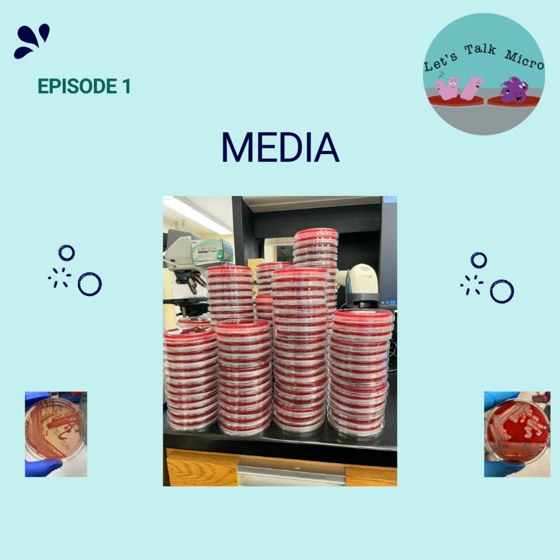And here's for your students out there. Here's where you have to be careful. You have to be as specific as you can be when you're describing the purpose of this agar. These are very typical questions that get asked, maybe if you're doing a clinical rotation at a hospital, or if you're taking a micro class.